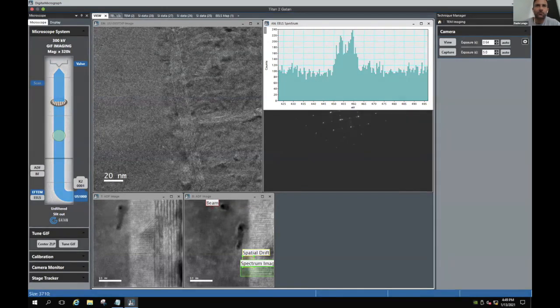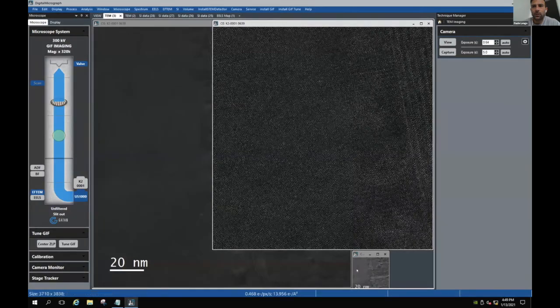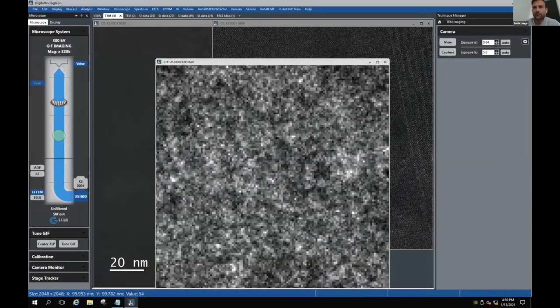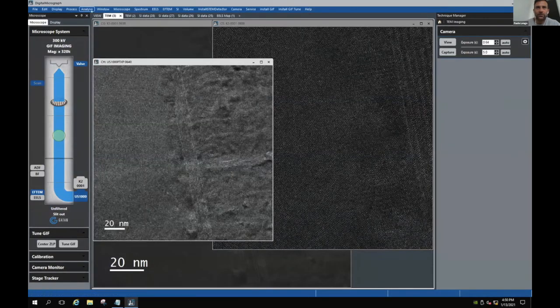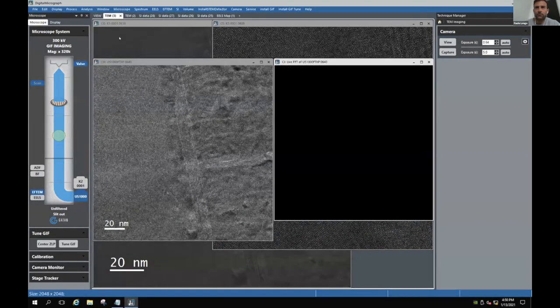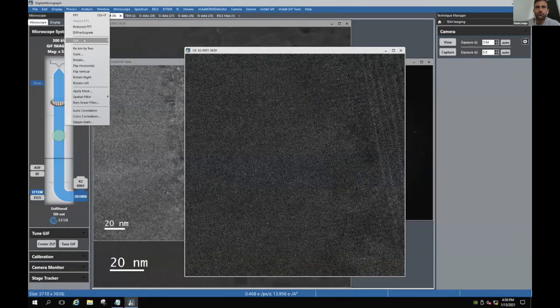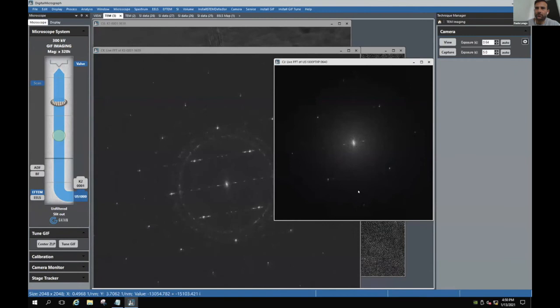Okay, so this is the UltraScan. You see something, but you don't have any information there. I mean, you don't see anything in the image. Did you actually have the information in the FFT? We can check. A little bit. What happens if we compare with the other one? So that's basically the difference in information that you are comparing. Wow, that's a huge difference. We go a lot farther there. I don't know if you have any questions on this.